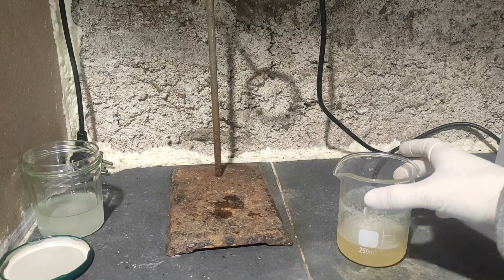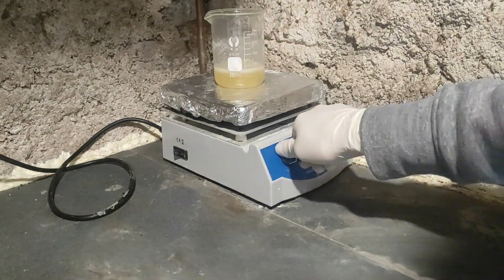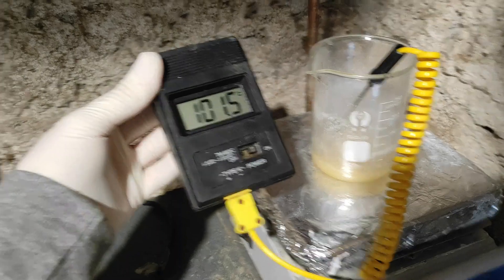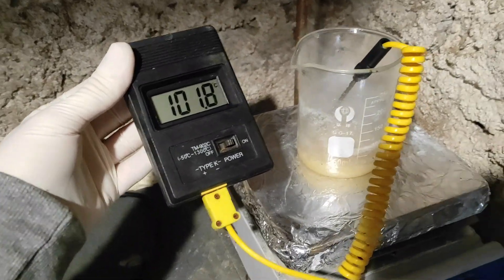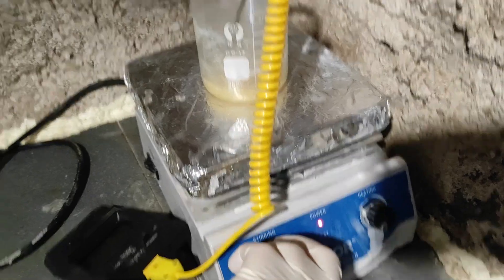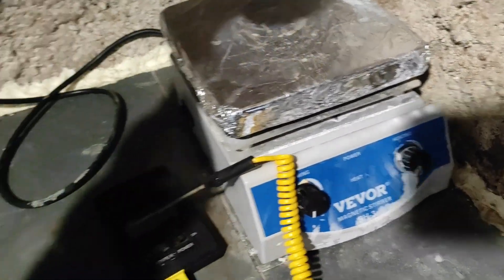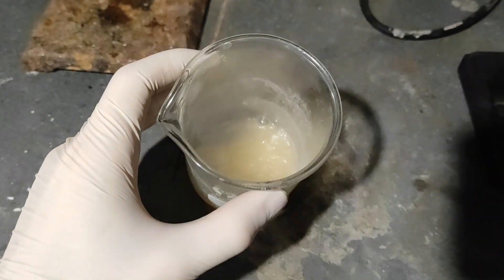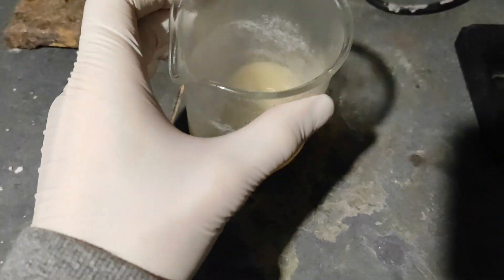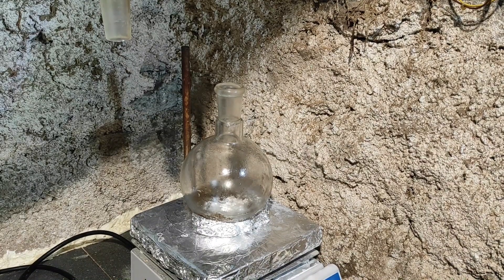I heated the solution to boil off the dichloromethane and be left with mostly our 1,2-dichloroethylbenzene. Now all of the dichloromethane has boiled off, and most of the water has also boiled off, so we can finally stop heating. We should be left with mostly the 1,2-dichloroethylbenzene — I don't remember the exact name, but basically that's what we have.